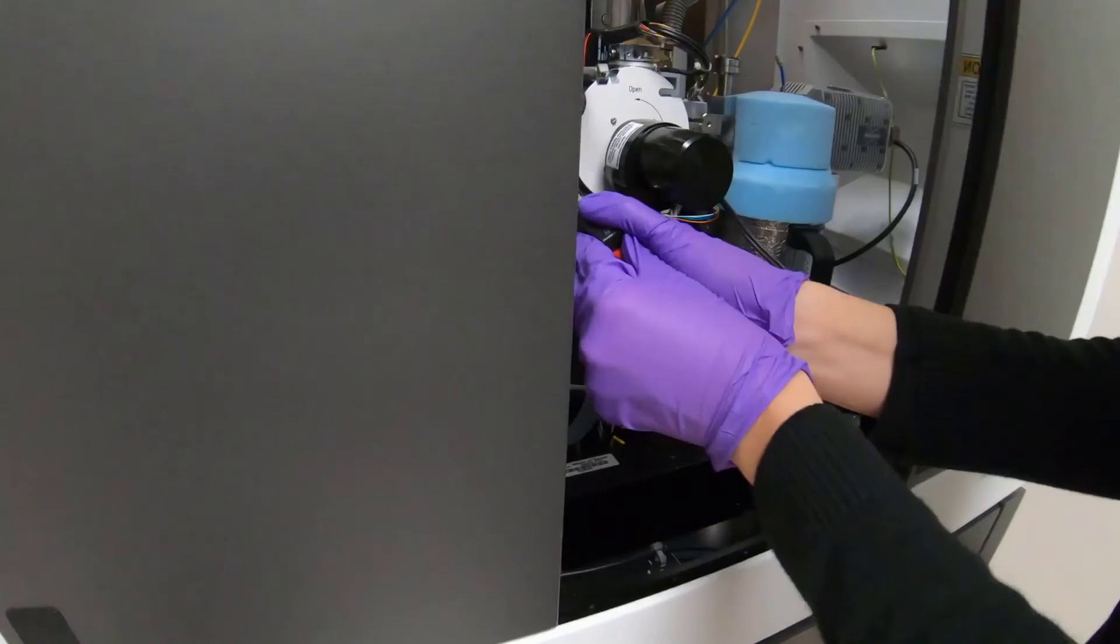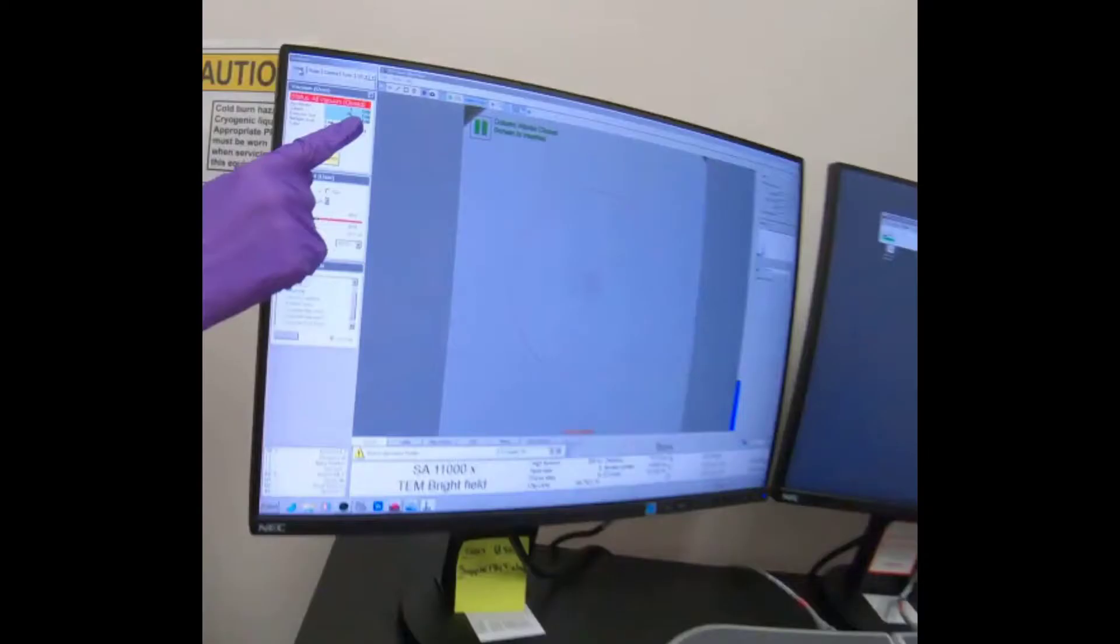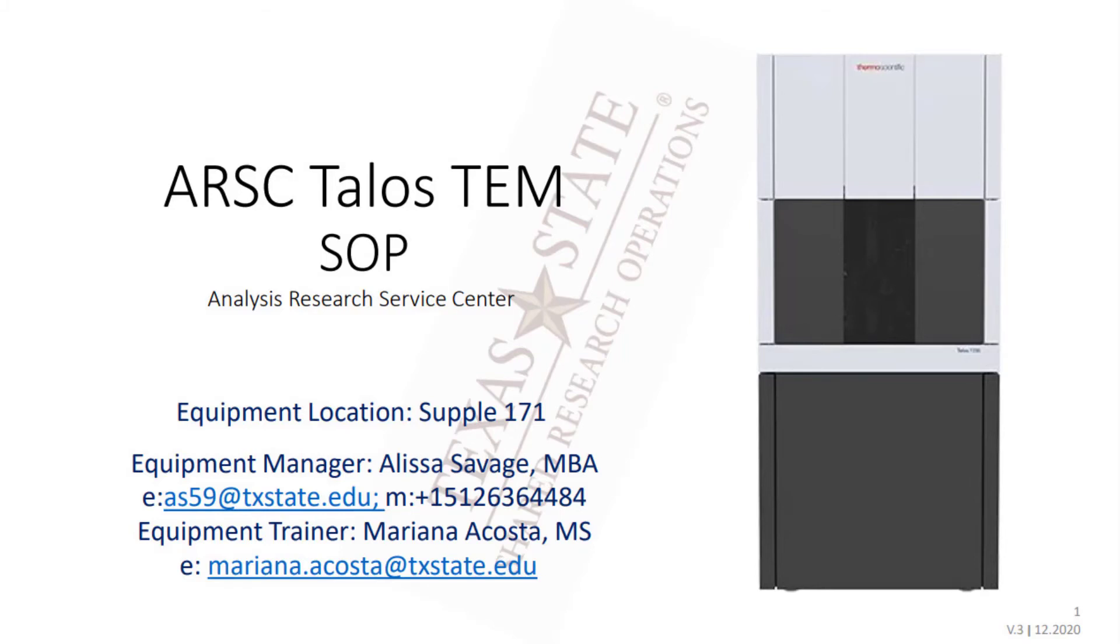Plug in the cable connection to the port on the left side of the airlock. Check the column vacuum again to verify it is at 20 log or lower before proceeding. Please check the ARSC TALOS TEM standard operating procedures for the next steps.